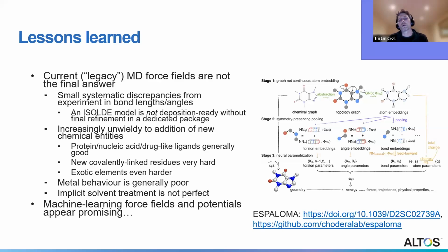And so there's a lot of promise here in next generation machine learning force fields and potentials. The machine learning force field is something that essentially will use a machine learning algorithm to apply your classical molecular dynamics parameters to a model, and then you just run molecular dynamics as you normally would. And the advantage here is that rather than working via the old school approach of individual residue templates, you just feed it your entire molecule as a graph representation, and it gives you parameters back for everything. As long as everything is within the chemical gamut of what it was trained upon, then everything should just work.